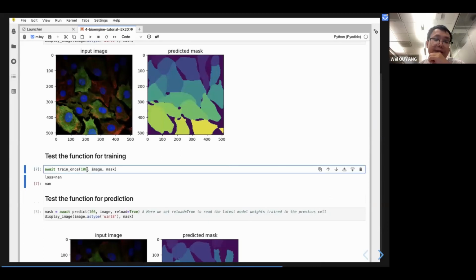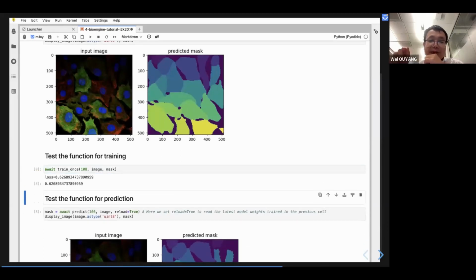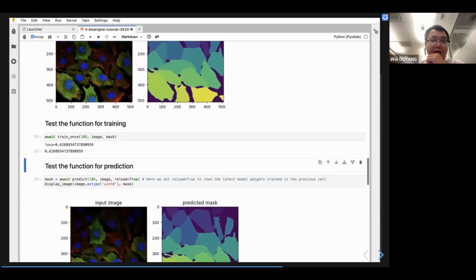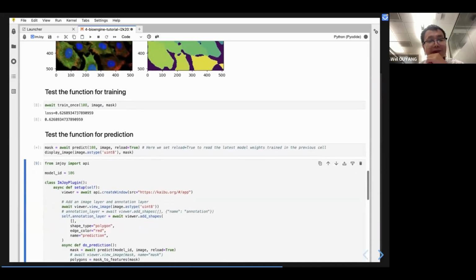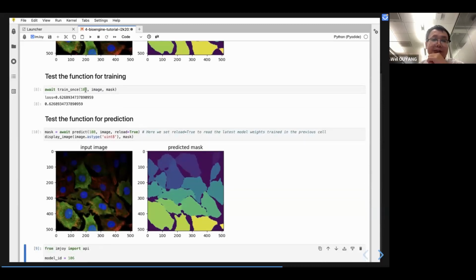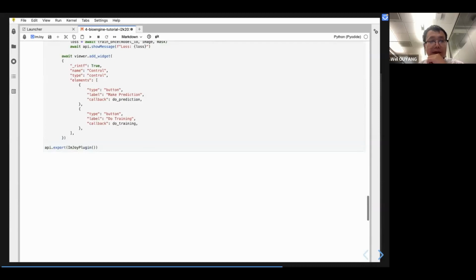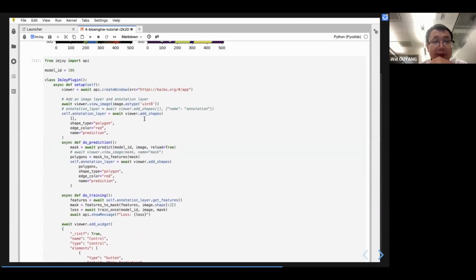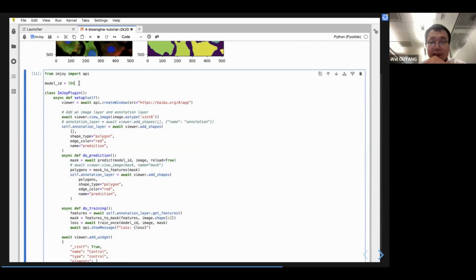Okay, so 106 is broken. We need to switch to 108, which is the same one as we did before. So we're going to train one step. Again, 106 is broken, switch to 108. 108 is just another model, right? It's the one we used in the previous step. And now this is the important part. Let me make sure that we already changed this 106 to 108.